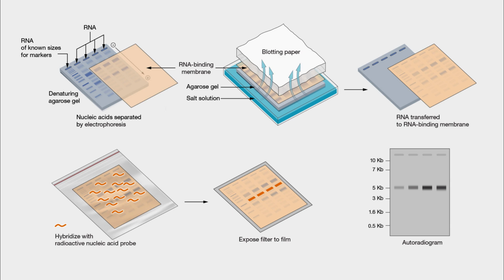The topic for today is Northern Blot. Do you know what is Northern Blot? Northern Blot is a laboratory analysis method used to study RNA.